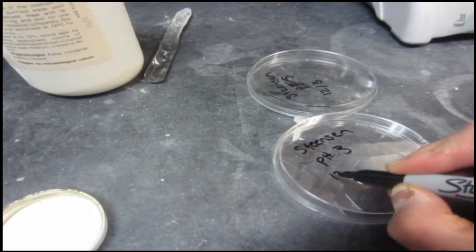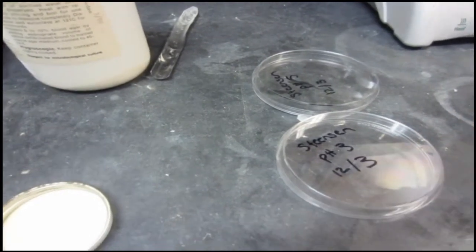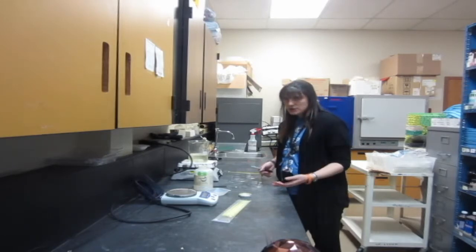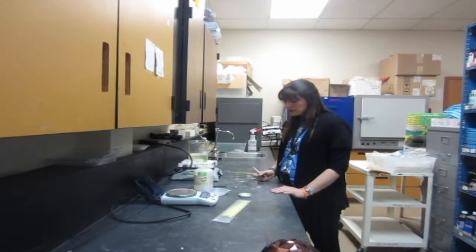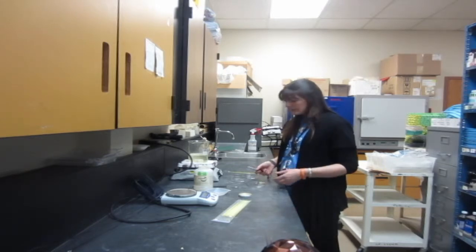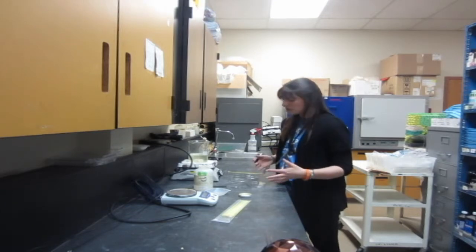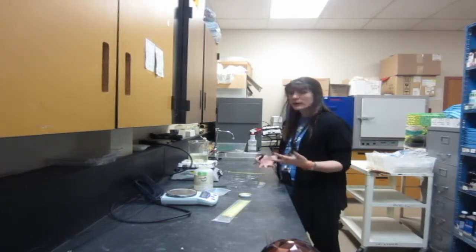You want to label it with your name. You want to label it with whatever trial it is that you're doing. Let's say you're changing pH. You want to change the pH in here and then add the agar, so you want to label what type of pH you're doing. It's also a good idea to put the date on there so you know when this was made, especially if you're doing a lot of different trials. That'll help you to stay organized.